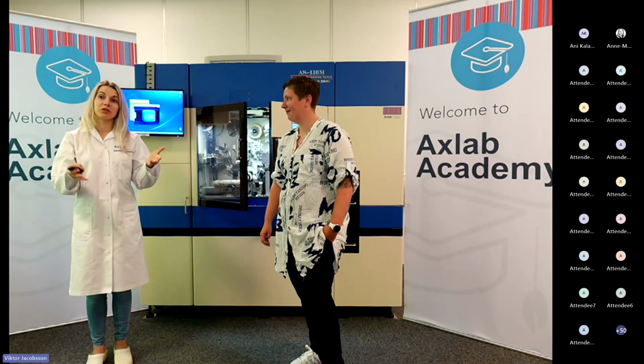Can you run multiple protocols at the same time? Actually, I think you can. It's quite funny because we are not doing it in our lab, but I know that has been an upgrade to the system, so you can do it. Yeah, so with the support within the LIMS provider, you're actually able to do more parameters with a different setup of how many blocks you actually require from those blocks. That could actually be something that the LIMS could support and do now. So you don't have to split your cases, split your blocks to do special parameters for each. Yeah, that's a really good thing.